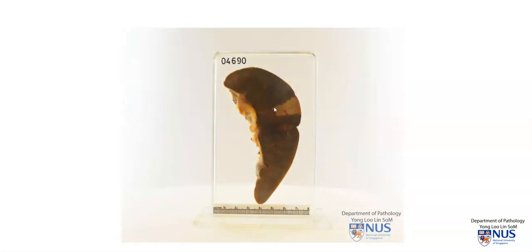There is a wedge-shaped area of pale tan discoloration with the broad base of the wedge at the capsular surface. This is an example of a splenic infarct.